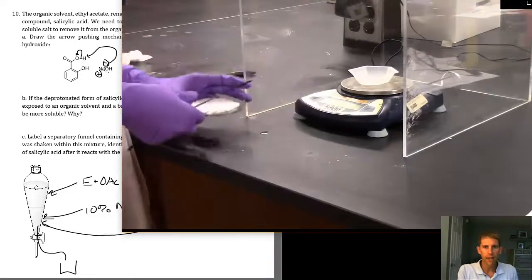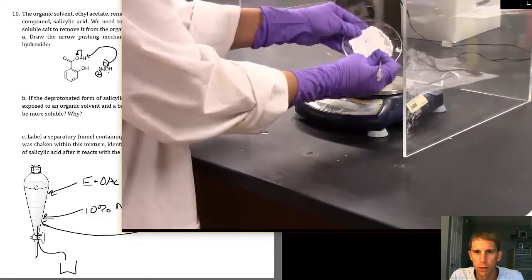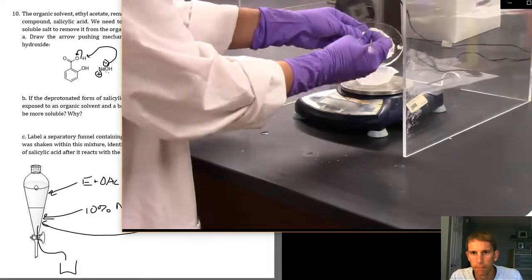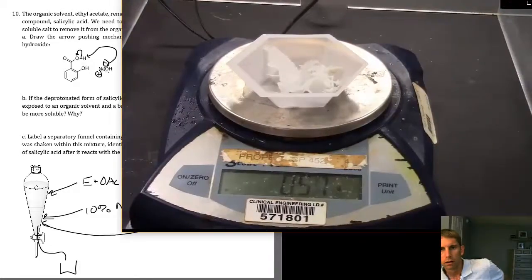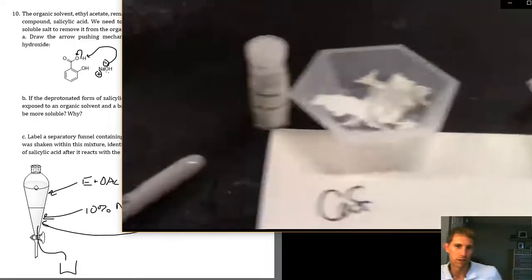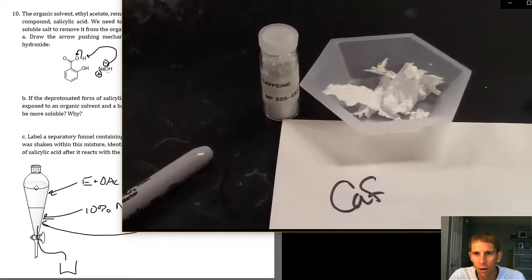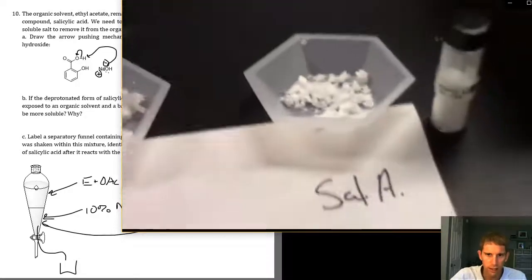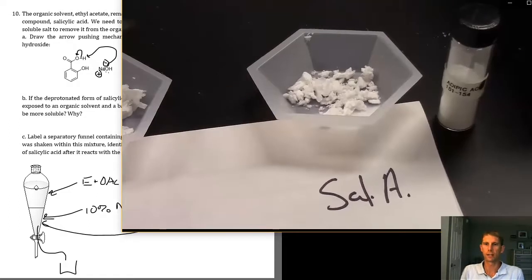For the caffeine, that paper does not look very good. The paper looks like it's pretty much crumbling off with the solid sample that we isolated. So possibly the paper, and you can see actually it looks like we don't have just solid particles. That was 0.58 grams. And you can see that there's paper right underneath some of the crystals that you see. So you're essentially seeing for the caffeine a mixture of paper and crystals. For the salicylic acid, just salicylic acid.